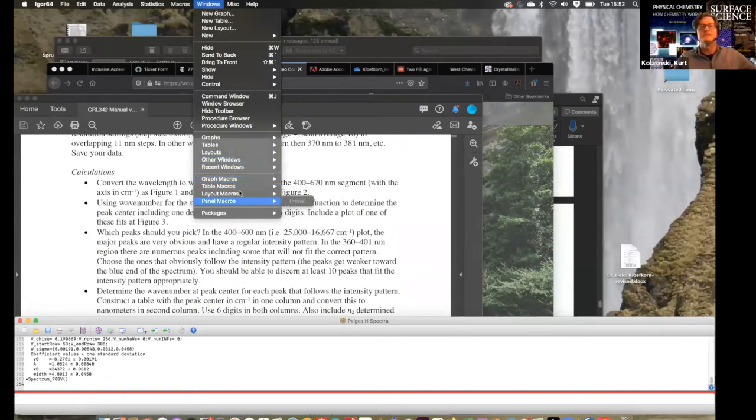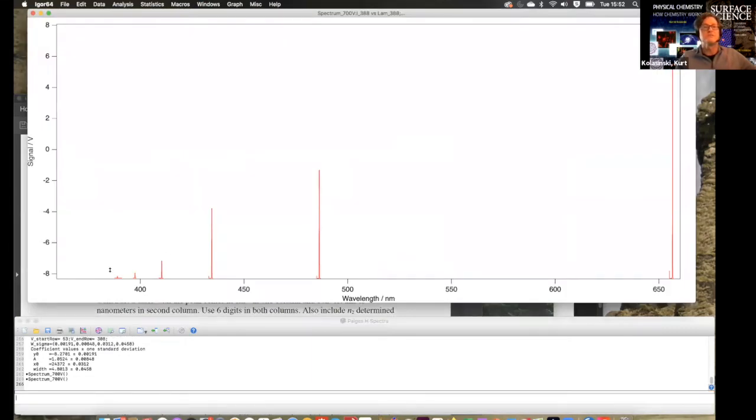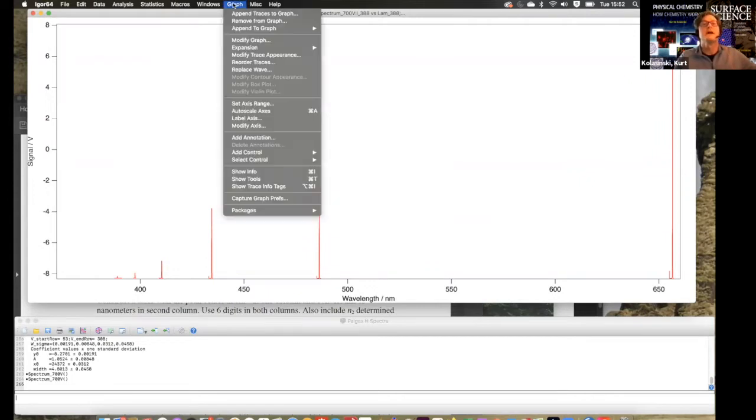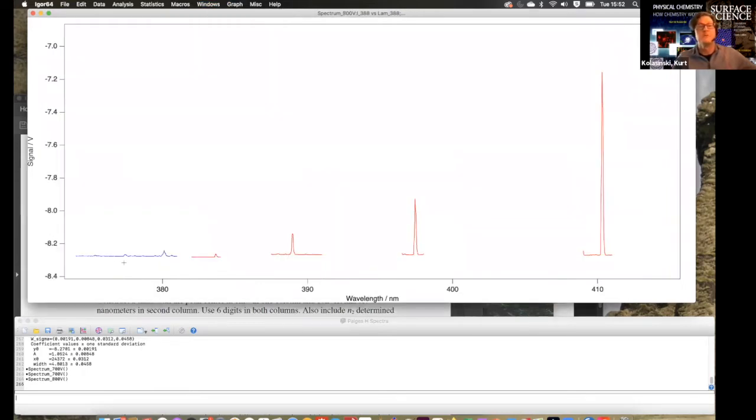Now, what we did was first, we took some data at 700 volts, right? So we started running out of signal down here. So then Paige cranked it up and took some data at 800 volts. All right, so here was the original stuff at 700. We were running out of intensity, and she turned it up and got more peaks to show up. There is a little bit higher intensity because we turned up the voltage on the PMT.